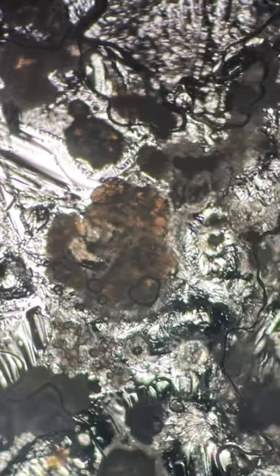Under a microscope they look absolutely crazy and they make some microscopic fractal cities. What else do you want to see next?